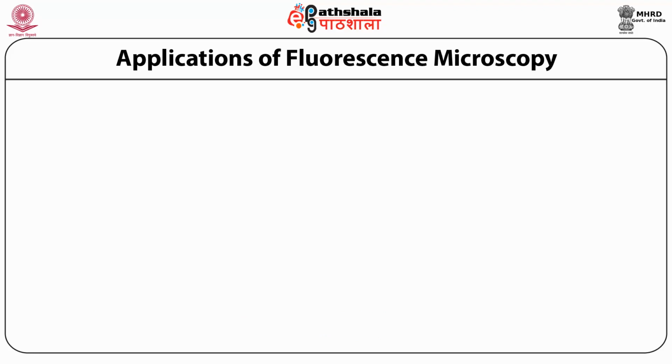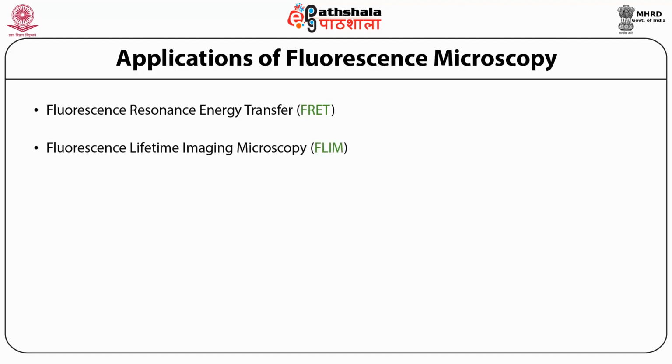Applications of fluorescence microscopy. There are a few advantages and a few applications which are very commonly used. Fluorescence based microscopies are FRET, which is fluorescence resonance energy transfer, FLIM, fluorescence lifetime imaging microscopy, as well as FRAP, which is fluorescence recovery after photobleaching.